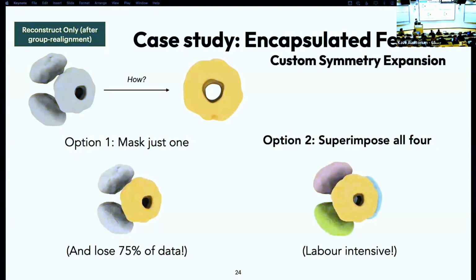Now, of course, symmetry averaging that involves a point group symmetry can normally be done via either symmetry expansion or a refinement with symmetry enforced. Since the symmetry doesn't follow a point group, particular steps are required to obtain properly symmetry averaged structures. The next few slides will show how to do this process, and I'll call this custom symmetry expansion.